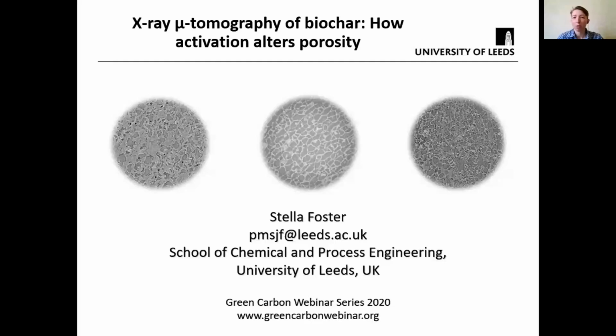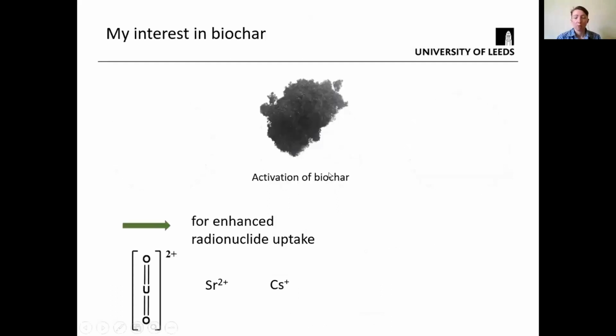I'm going to talk about microtomography and its use in appraising the macroporosity of biochar. So a little bit about my interest in biochar, just to give you some context. I'm interested in developing ways to functionalize or activate biochar to enhance absorption for cationic radionuclide species. I'm primarily interested in strontium, cesium, and uranyl. And I'm interested in how activation can tune the pore architecture for this application.